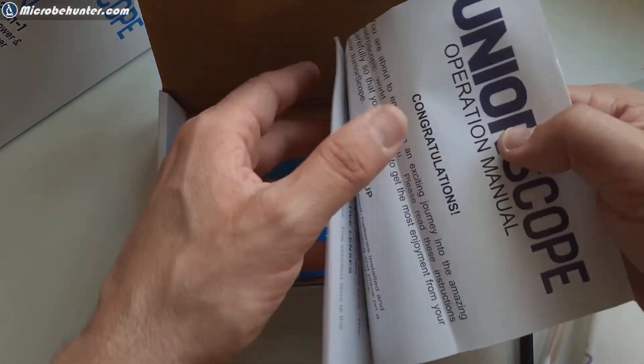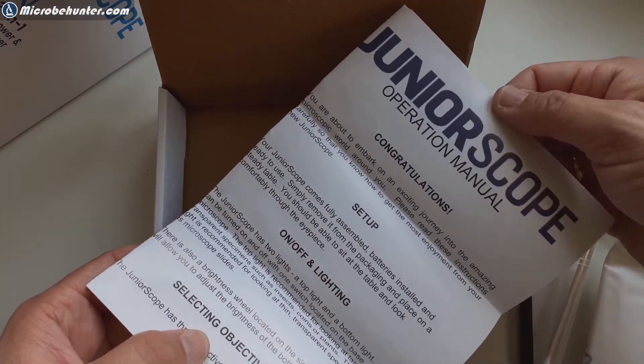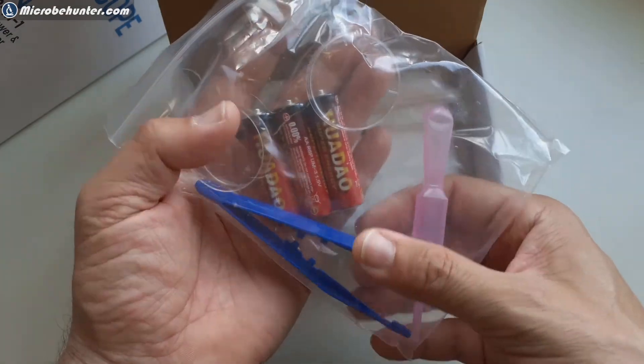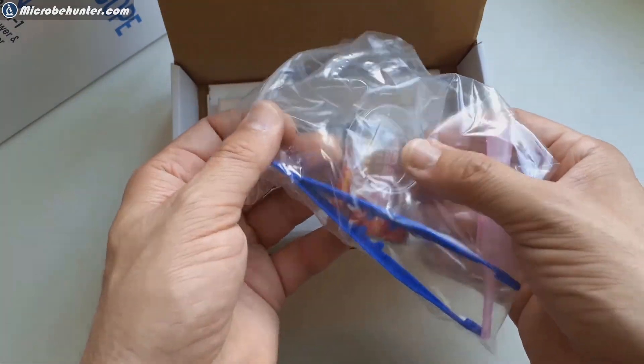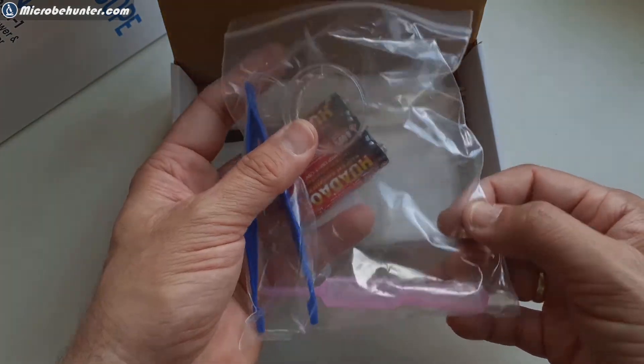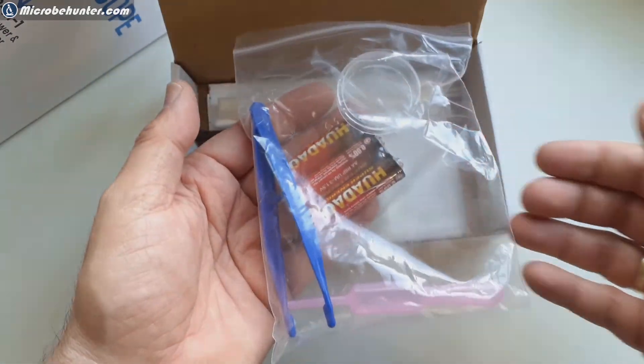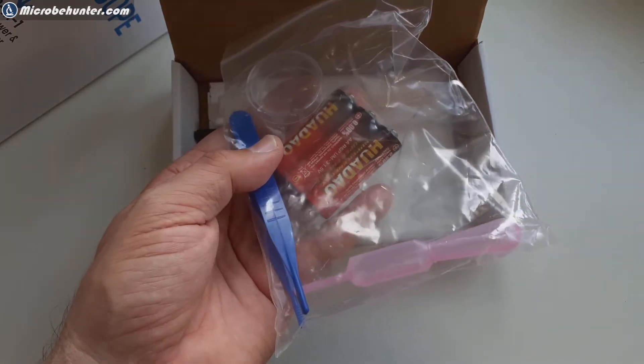Of course also the instruction manuals are here. So I had a closer look at the accessories. The plastic petri dish is used to store some water if you want to make a temporary mount and everything looks quite nice.